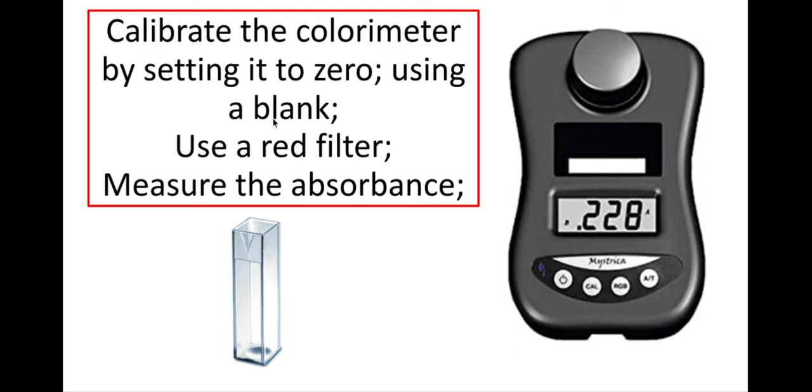Now they don't like it here when you say using water, you have to say using a blank. So I'm going to calibrate my colorimeter by setting it to zero using a blank.